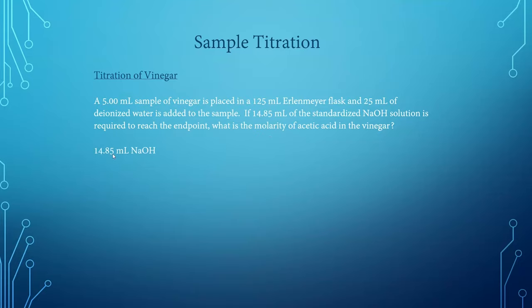We know we used 14.85 milliliters of sodium hydroxide. We have to change milliliters into liters, of course, because that's what molarity is in. If we multiply that volume times the molarity of our standardized solution, we now know how many moles of sodium hydroxide were required to reach the endpoint.